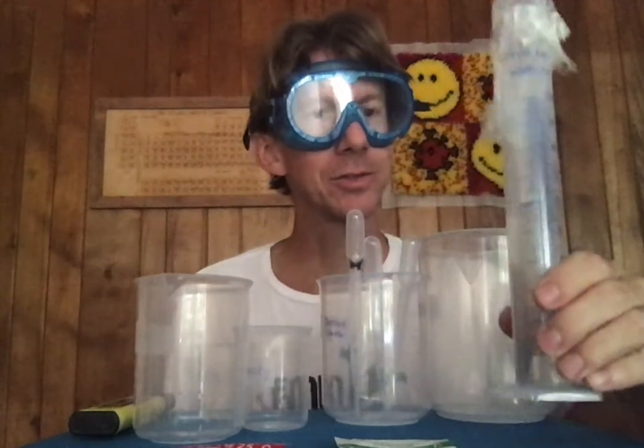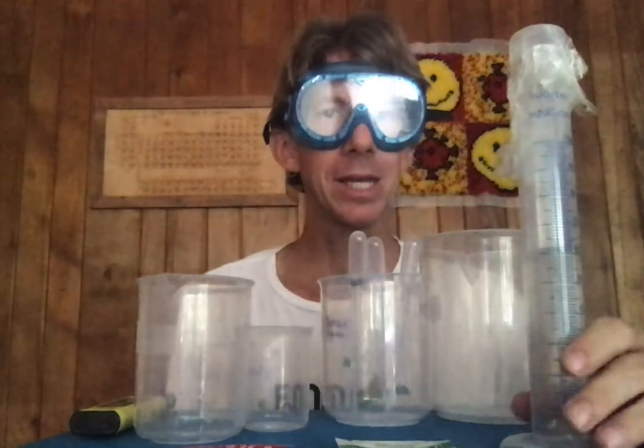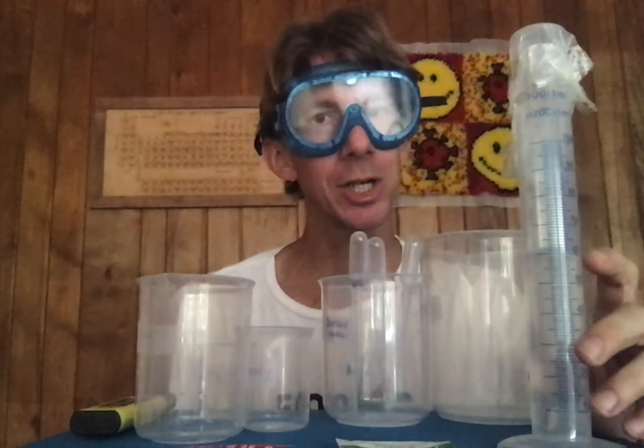I have my sodium carbonate solution from experiment four that I made, and I know the concentration of this sodium carbonate solution. You can see I've used some of my sodium carbonate solution because I just finished running the lab, and good news, it works.